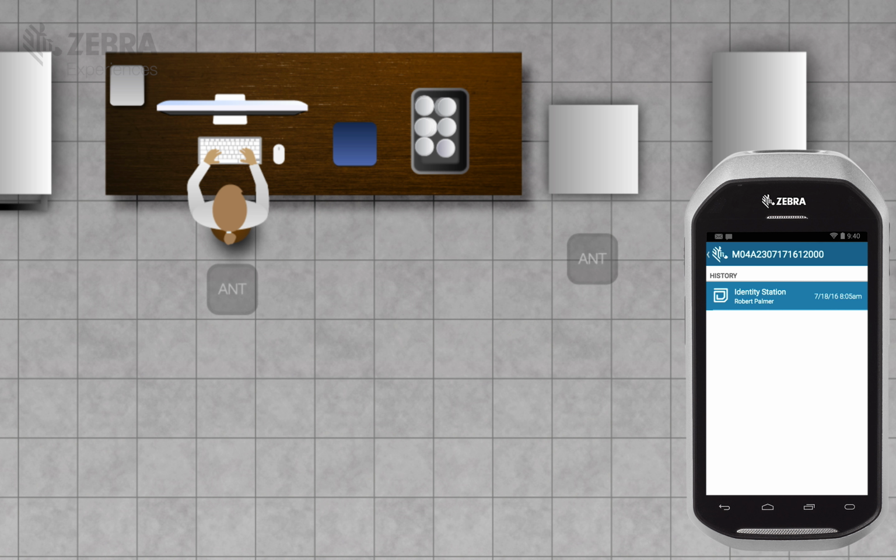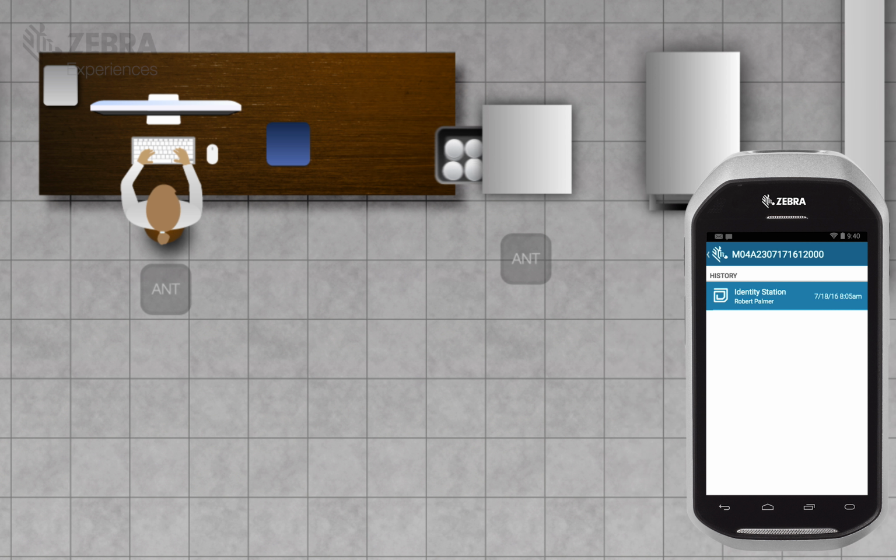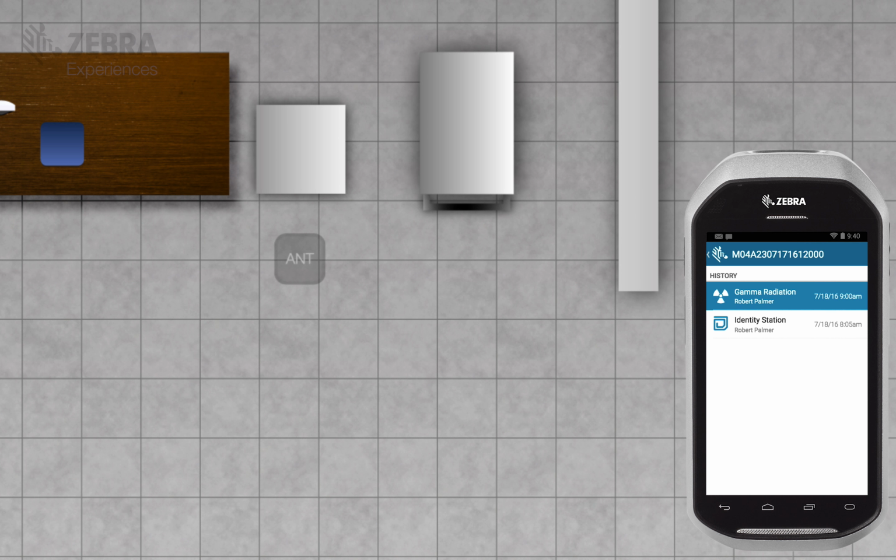Once a tray is filled, an operator places the tray into the sterilization equipment, where another antenna detects the presence of the cultures as well as the operator, logging that activity along with the time and date. In the application you're seeing here, we are tracking the progress of a single culture, and you'll see how the status changes over time.